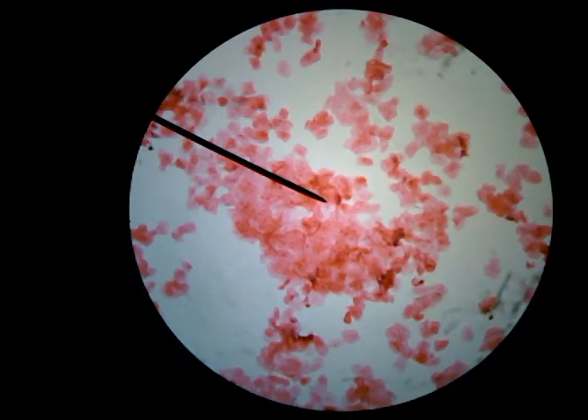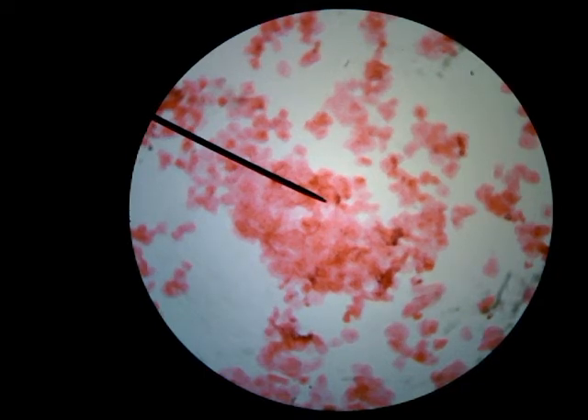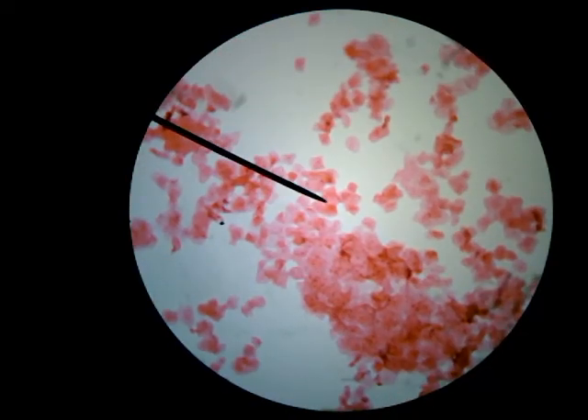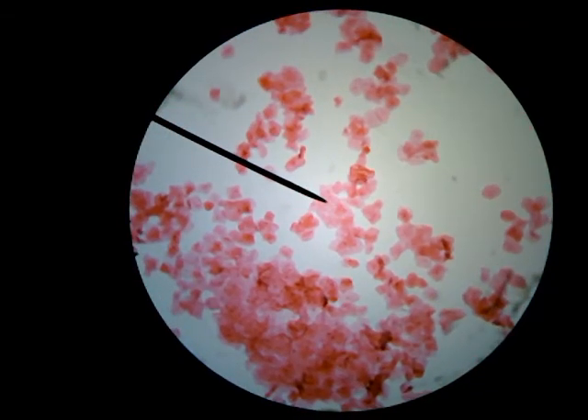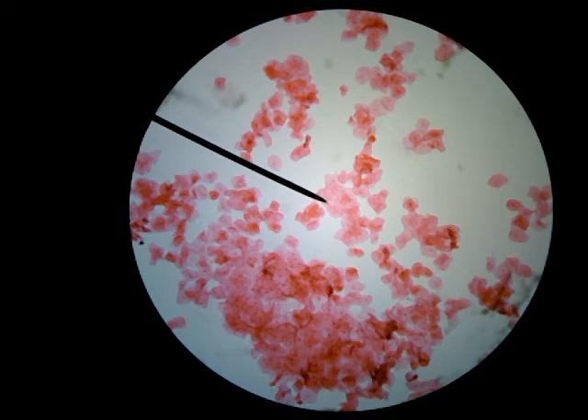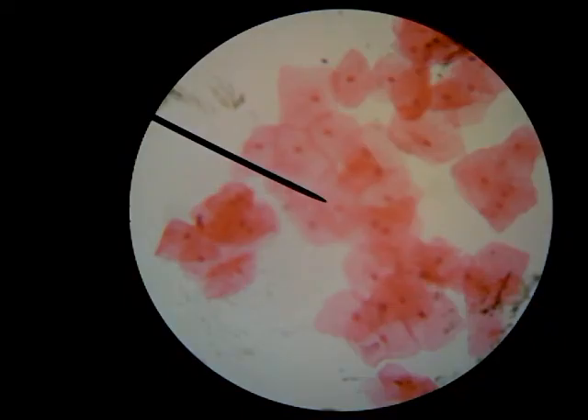I'm going to refocus a little bit — switching to fine focus. There we go, now we're starting to see some stuff. Up above the needle there are some clumps and you can see it really well. I think I may try and move. Everything's also backwards because of the camera. I actually like this clump right here, so I'm going to zoom in on that one instead. So this is the medium magnification. I'm now going to zoom all the way in and use my highest magnification.